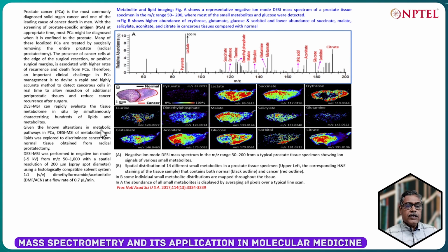Given the known alteration in metabolite pathways from the literature, DESI MSI of metabolites and lipids was explored to discriminate cancer from normal tissue obtained from radical prostatectomy.